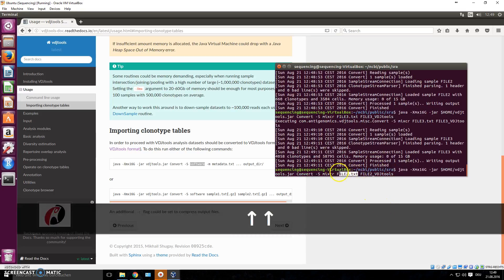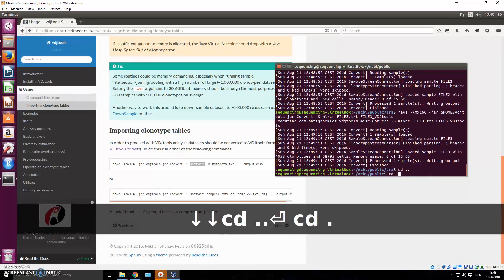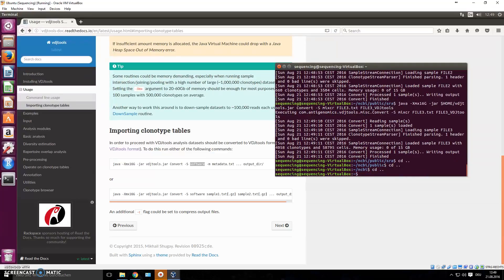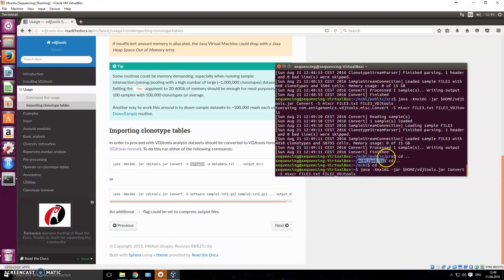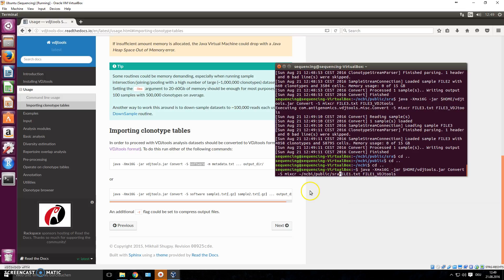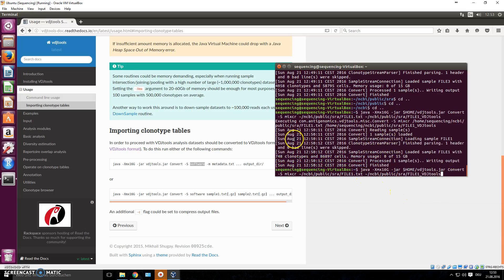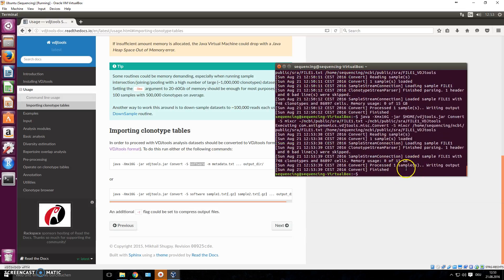We were able to just write 'file2' because we were in the folder where file2.txt is located. If you're not in that folder you have to provide the entire path. For example, from the home directory, you'd have to prefix the full path like '/home/user/ncbi/public/sra/file1.txt' for the input and output. If you don't give the entire path it won't work. Now we've converted everything — let's do our summary analysis.